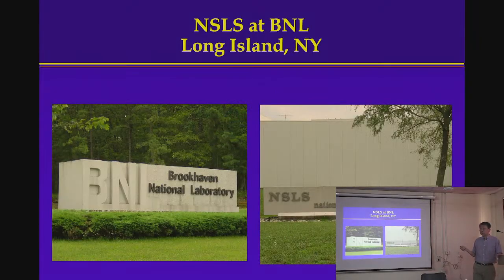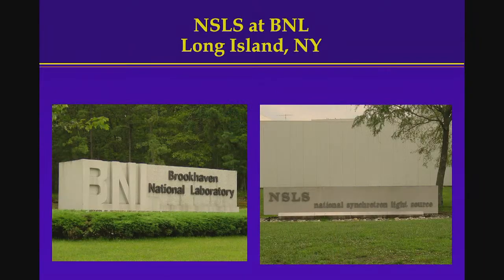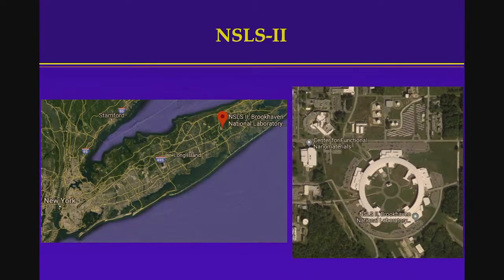Okay, so that's the home source. And synchrotrons: the one closest to Columbia in New York is the one on Long Island, New York. It's called Brookhaven National Laboratory, National Synchrotron Light Source. And this was in existence for 30-some years, I believe. And then maybe 10 years ago now, it got retired, and a new synchrotron ring right here was built. That's the sequel.